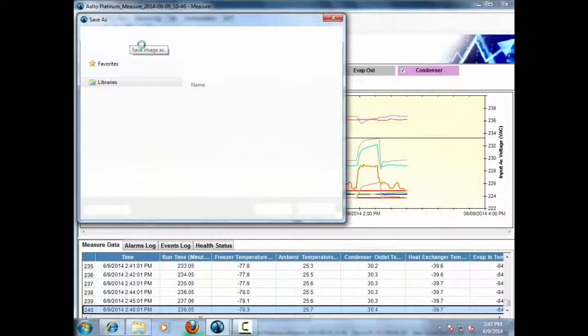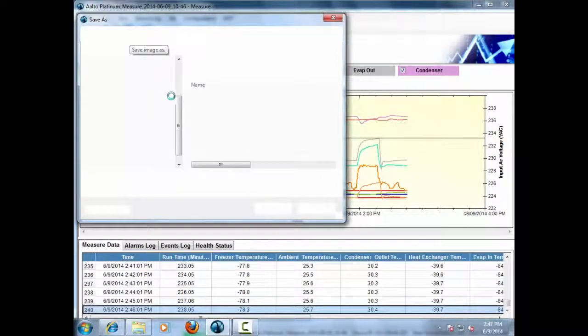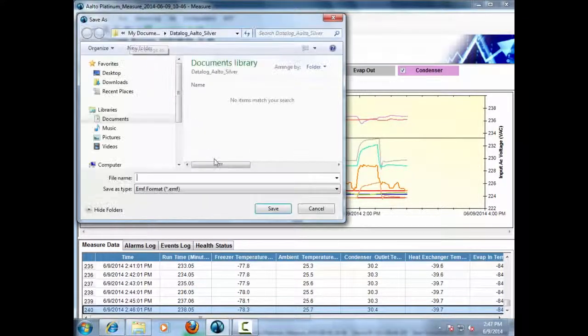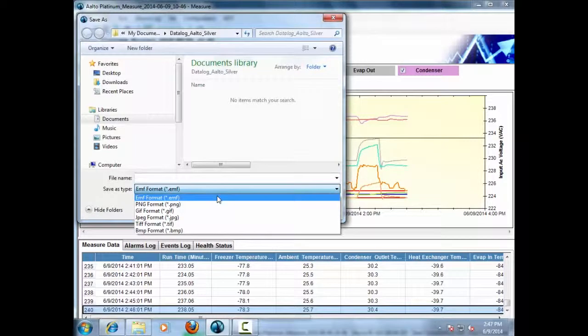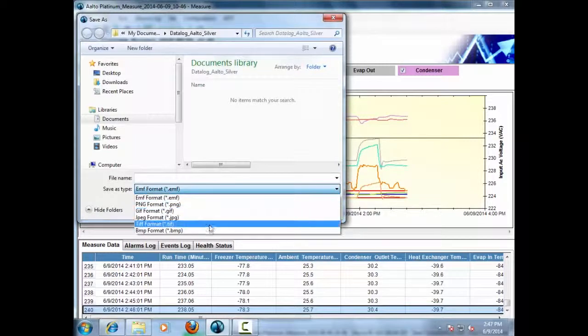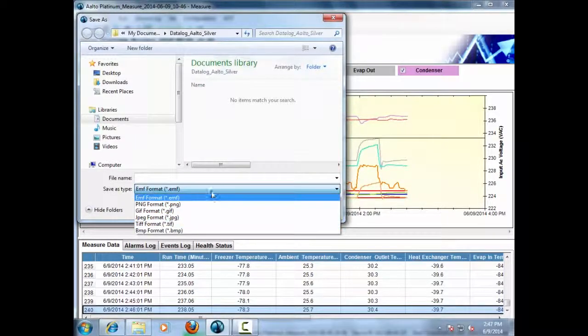Also, the graph can be expanded horizontally or vertically, or stretched horizontally or vertically.